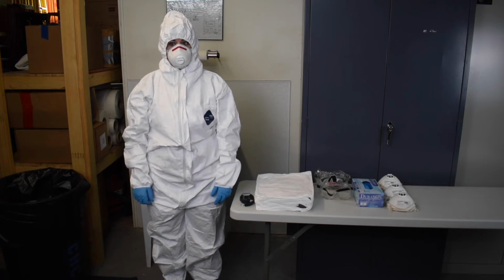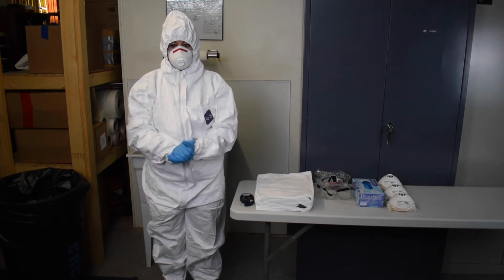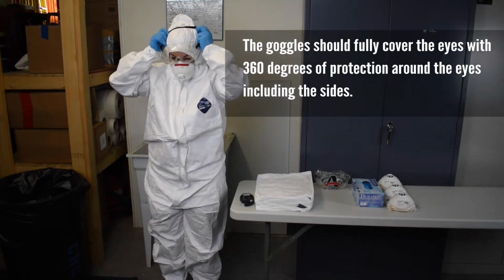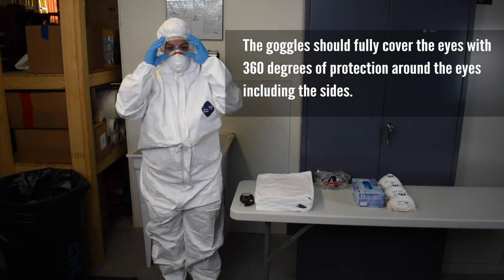CDC does not recommend double gloves or extended length gloves at this time. Next, put on your goggles. The goggles should be put on over your hood. The goggles should fully cover the eyes with 360 degrees of protection around the eyes, including the sides.